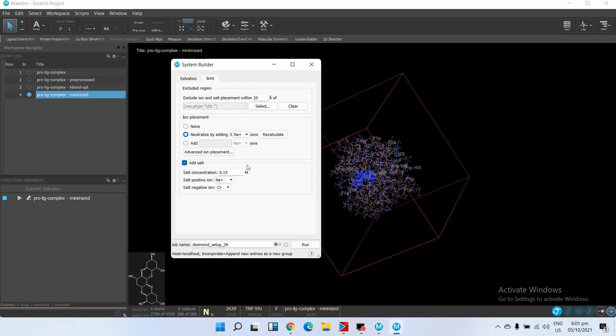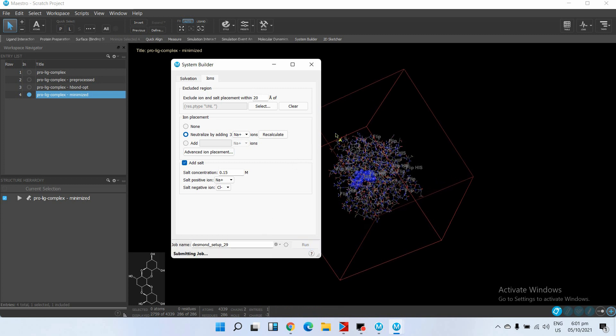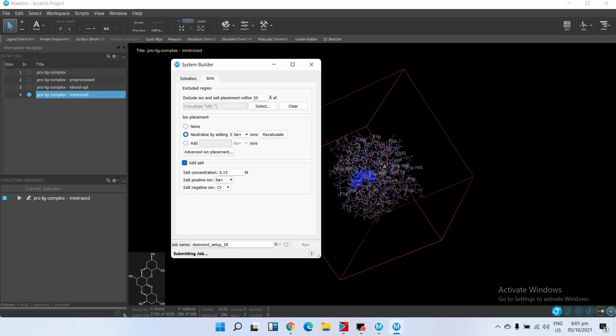After selecting these parameters, just click on Run, and System Builder will create a virtual water box around our complex.